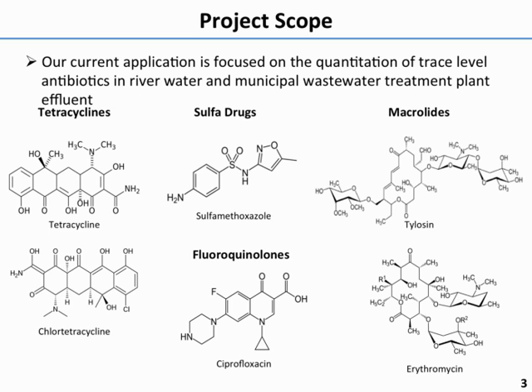This project is part of a collaboration with 2 other groups who are doing biological work on these same water samples. So initially we've started out with a pretty broad view, looking at compounds from several different classes here. And if you've done any work with especially some of these compounds, you know that they're notoriously difficult to work with. The tetracyclines stick to everything, really difficult to recover at low concentrations. And so I think the chemical diversity here represents a challenge.